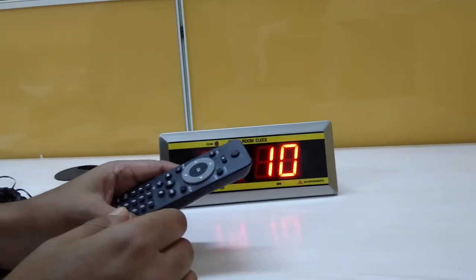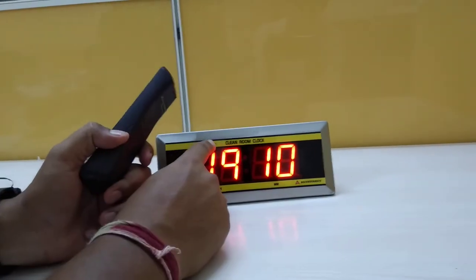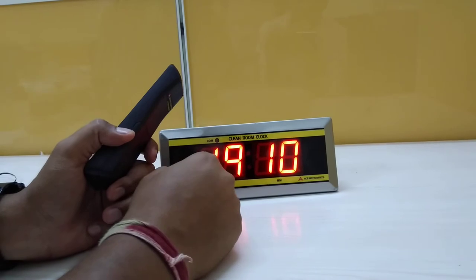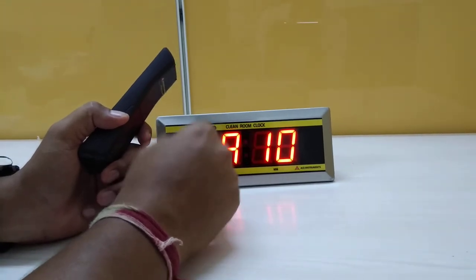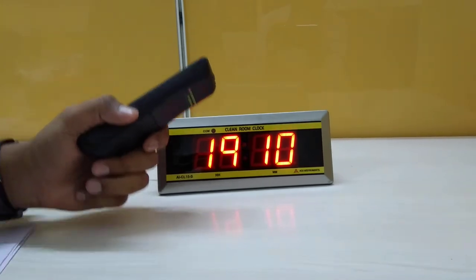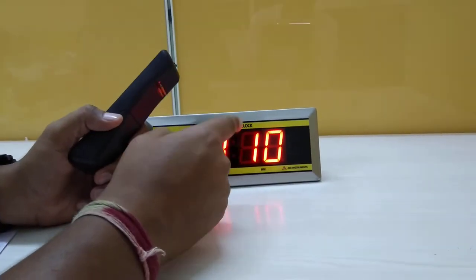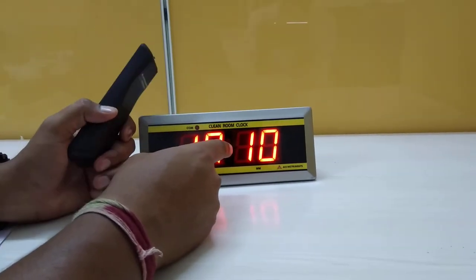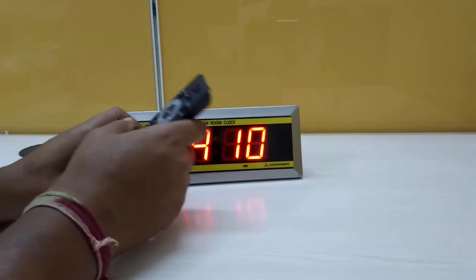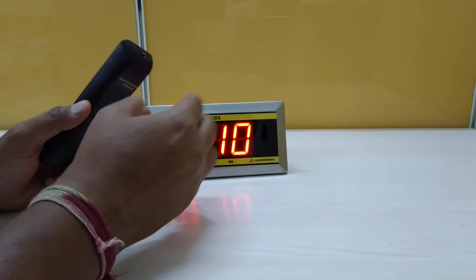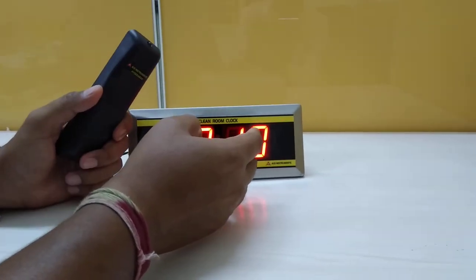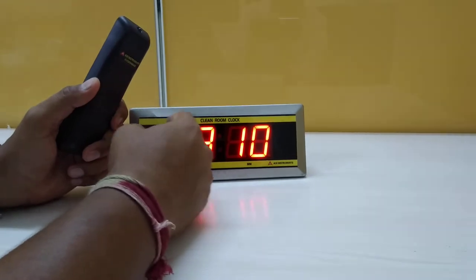This is the basic function of the remote to set the time. This has got a communication option also, RS 45 communication option, and we have several options in this clock. This is a standalone clock. We have an option of GPS clock also, and we have options in 2.5 inches and 4 inches.